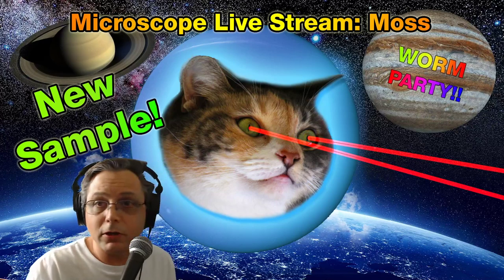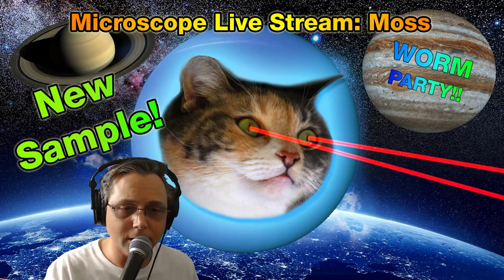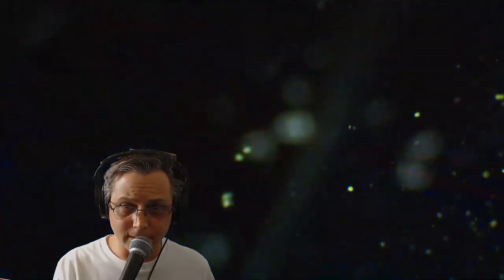All right, so we're looking at some tree moss we scraped off of a tree, and again I forgot to get the image in the video, but okay, we're just gonna look at it. Okay, here we go. Right here at the edge of the drop, near the top of the drop.